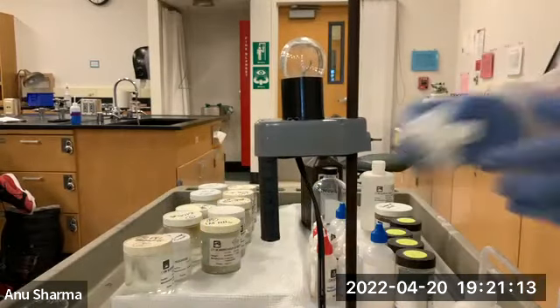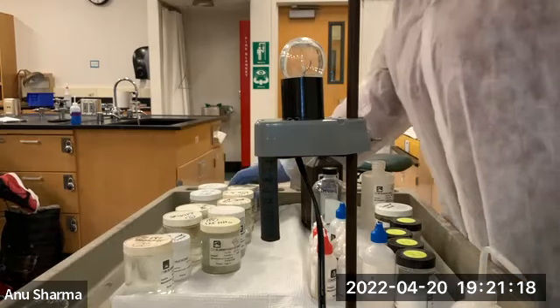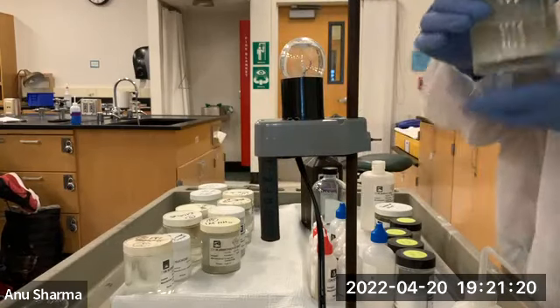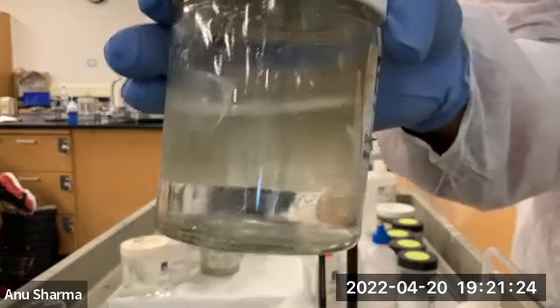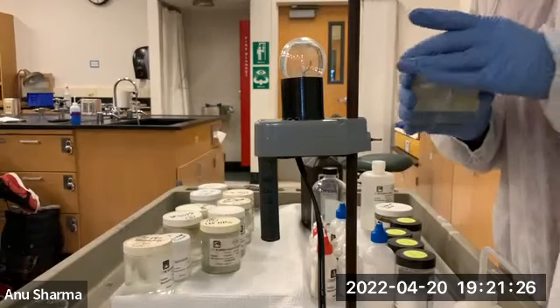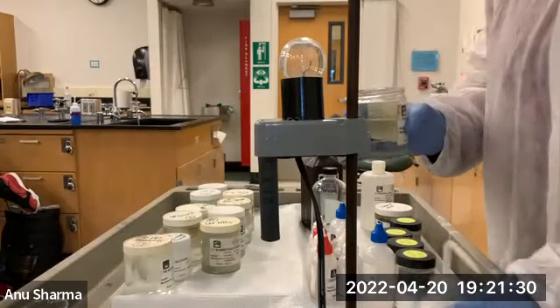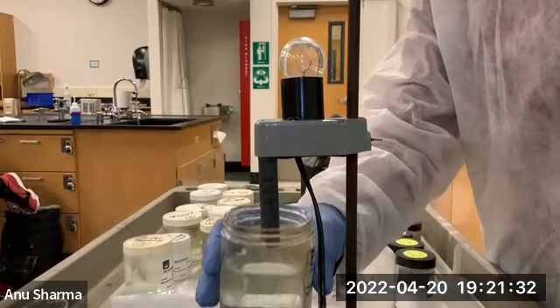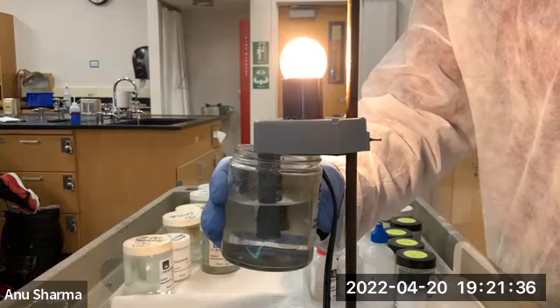Okay. All right, now we have HCl, hydrochloric acid. Nice clear solution, okay? And HCl, remember I told you 100% ionization. Now pay attention to the bulb. Look at that, how bright it is.